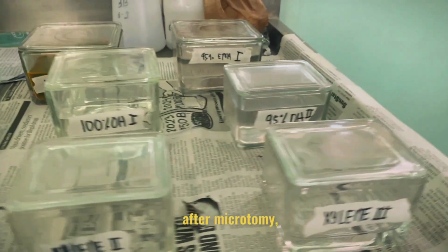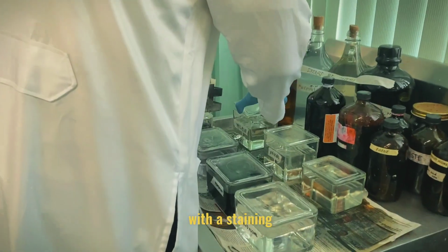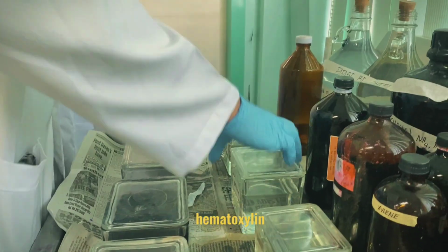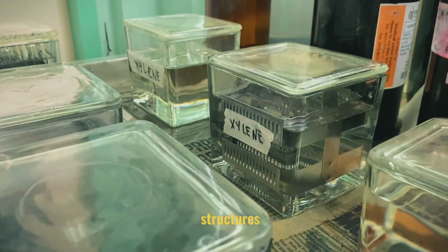After microtomy, adhesion, and the fish out procedure, we will then proceed with the staining process using hematoxylin and eosin as the staining protocol to highlight the cellular structures.